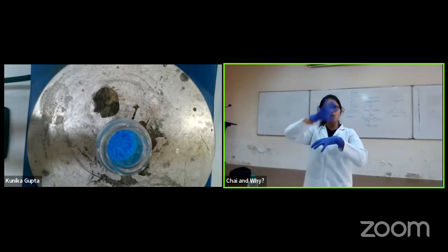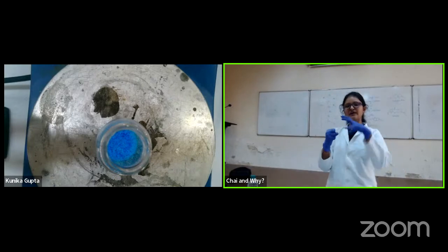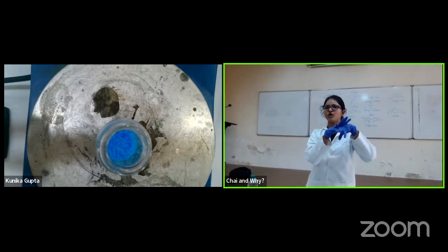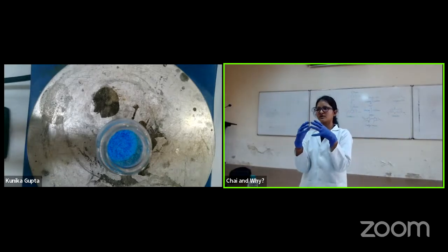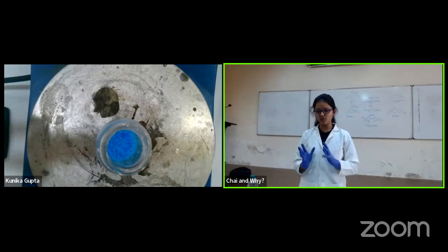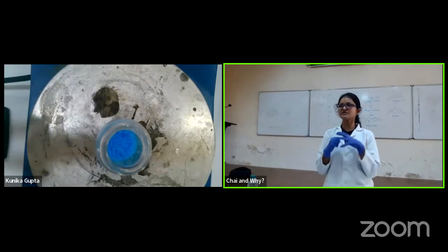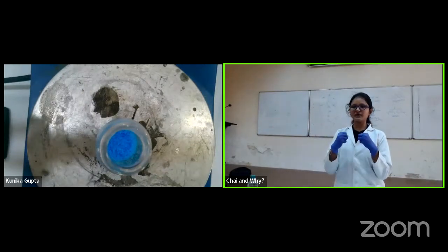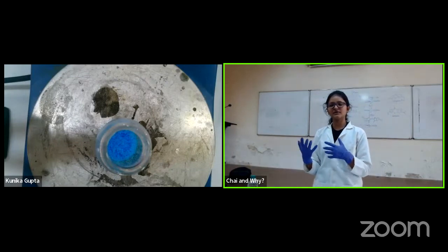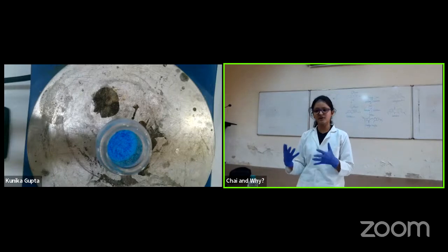Fine. So the reporter unit which we designed is a dye. When it has not caught the metal, it will remain in a quenched form, and when it has caught it, it will be in a turn-on state. So I'll see fluorescence out of it. I'll show you a small demo of the dye, not the scaffold, because that is something we have to synthesize very specifically. Because in our lab we aim to detect manganese ions in a live cell, in a living world.